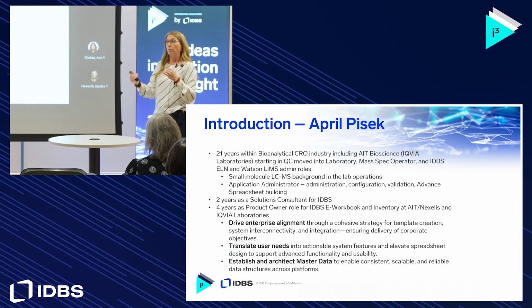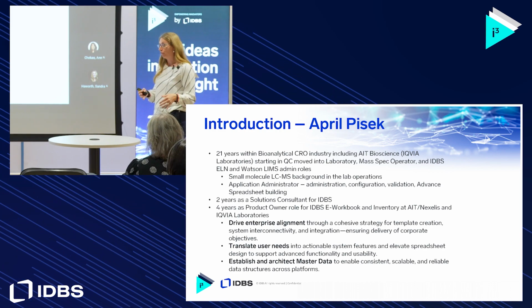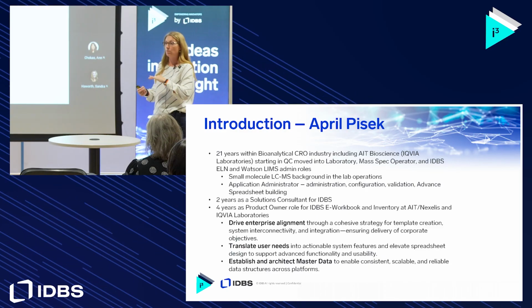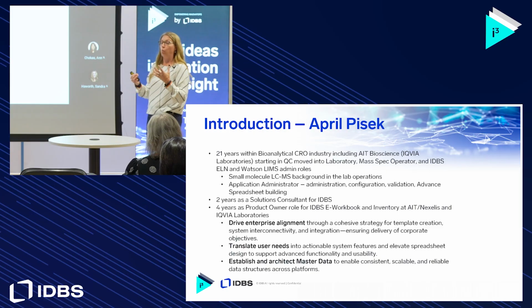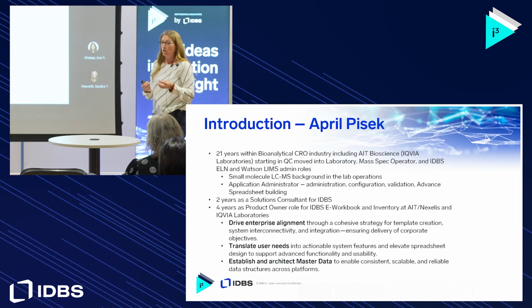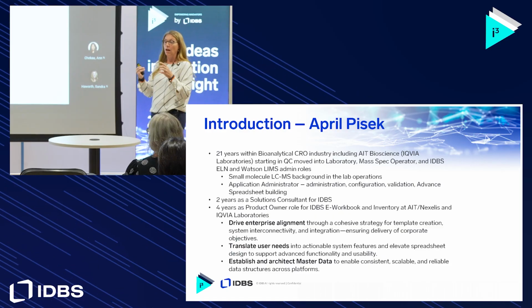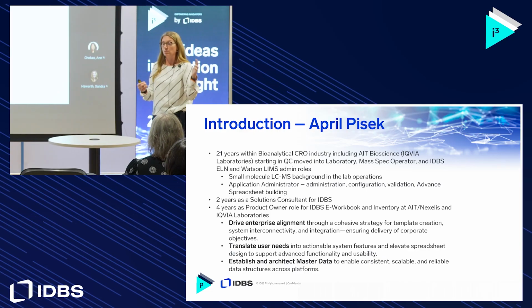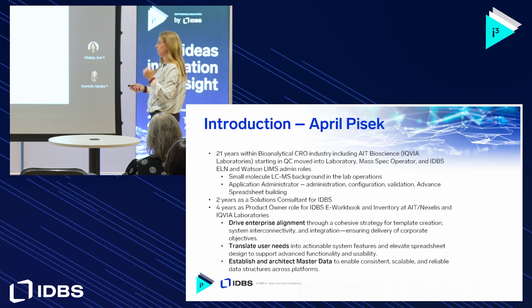So by the end of this year, we're looking to have around 85 templates that cover every single process, Excel file, anything that we can do to completely get off paper. And while we're doing that, we're establishing our master data. The other thing that you'll hear throughout the presentation is that it's not just the data in IDBS Polar, but how that data also aligns with all the other systems and platforms for our large IQVIA Labs master data model.